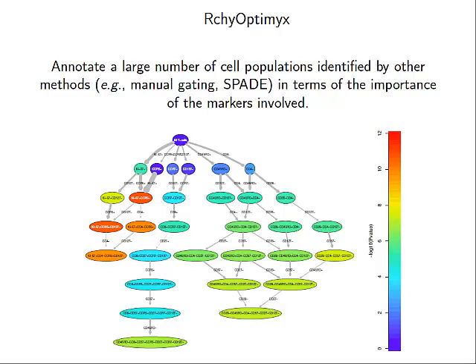The way we did it is, if the population that's going to distinguish between group one and group two looks like this example population, where it's proportion one, proportion two, and the proportions are this different, we would need this many samples. So it depends, but that kind of skirts around the issue of how easy it is to automatically distinguish between population one and population two. That's a separate problem, right?